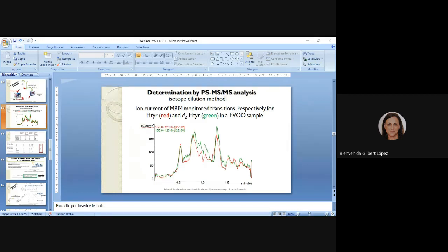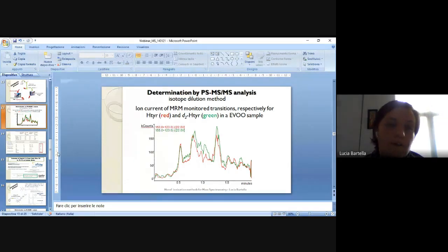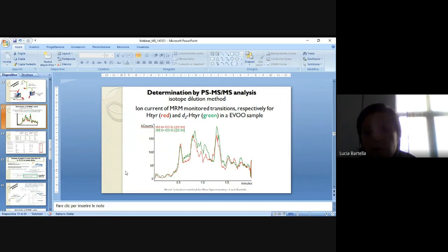The first thing I want to ask you, maybe you said it during the presentation, sorry if you have explained it before: how do you prepare the paper triangle? Do you do it by hand, or do you have an established method to make it reproducible? No, I prepared the paper using Whatman paper, classical Whatman paper.